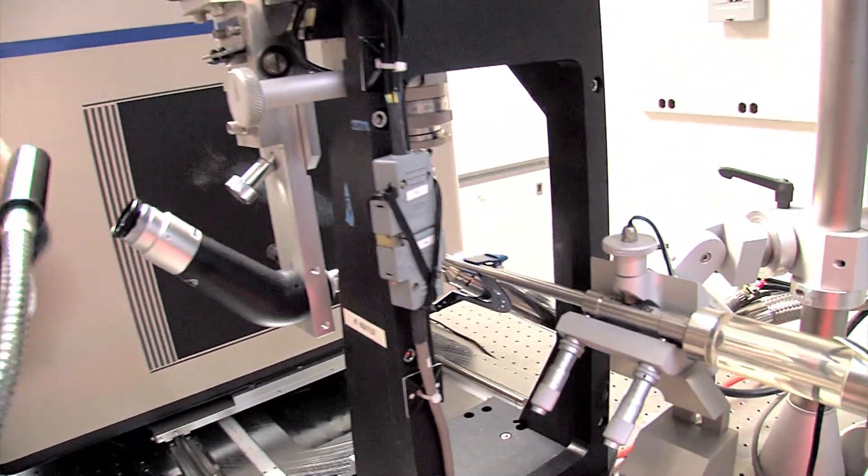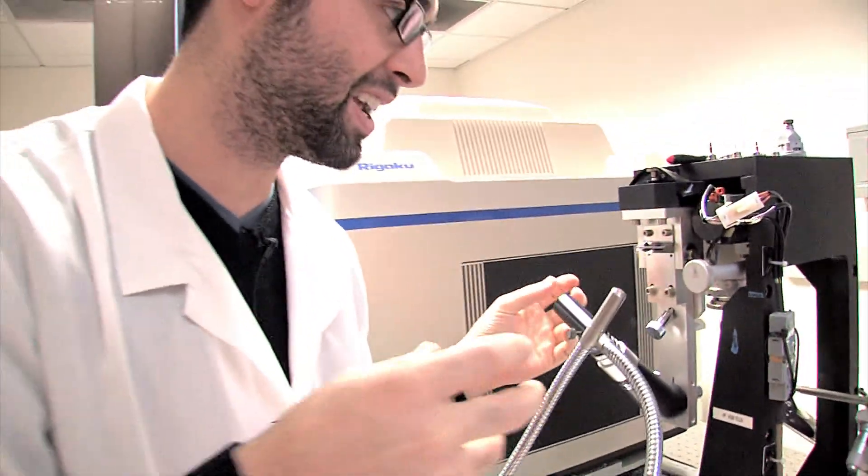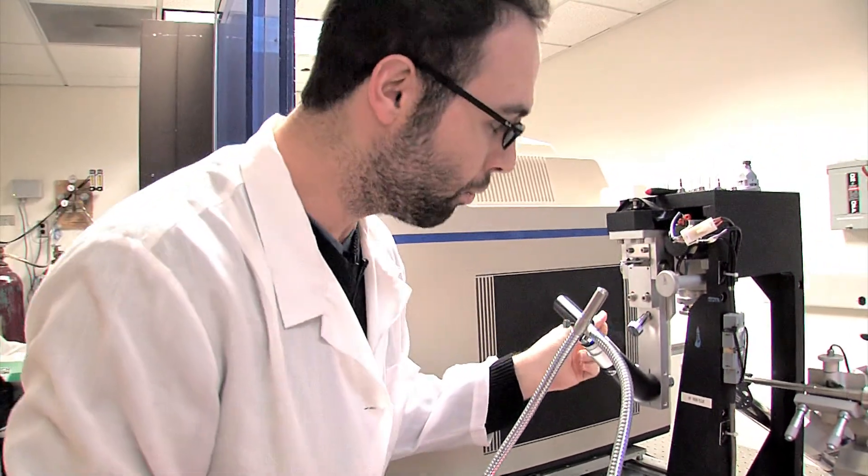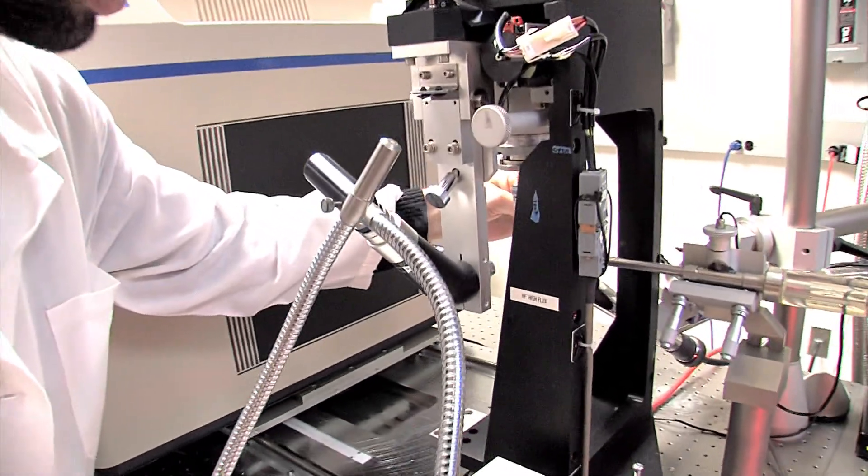Now, to keep the crystal from being totally destroyed by the really intense X-rays that are coming out of this, we keep it super cold. And that's what this machine is doing here.